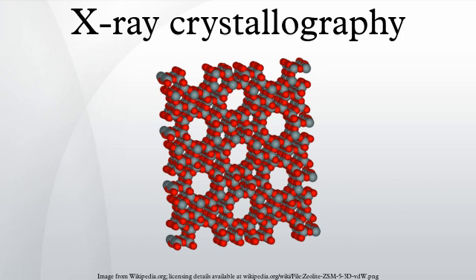Several factors are known to inhibit or mar crystallization. The growing crystals are generally held at a constant temperature and protected from shocks or vibrations that might disturb their crystallization. Impurities in the molecules or in the crystallization solutions are often inimical to crystallization. Conformational flexibility in the molecule also tends to make crystallization less likely, due to entropy. Ironically, molecules that tend to self-assemble into regular helices are often unwilling to assemble into crystals.